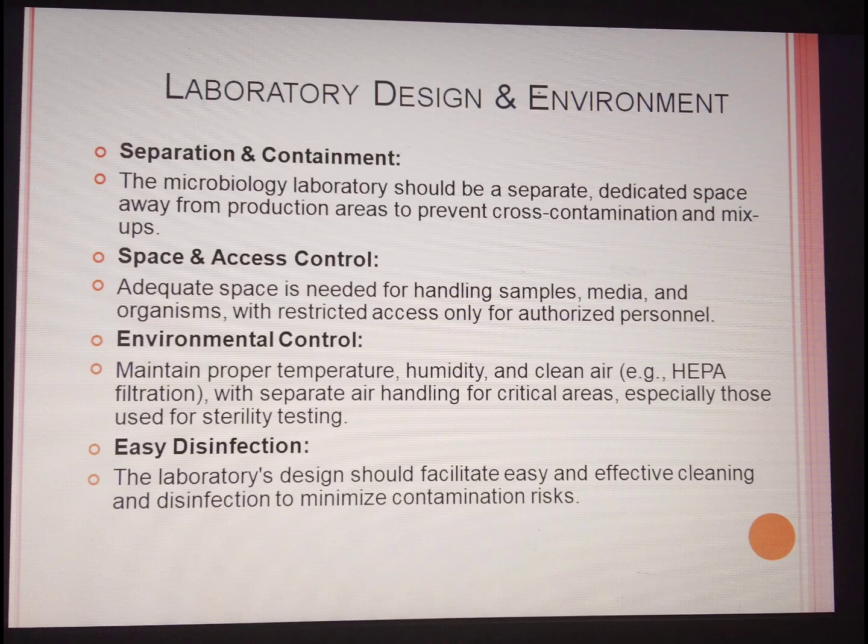personnel. Environmental control. Maintain proper temperature, humidity and clean air, for example HEPA, high efficiency particulate air filter, with separate air handling for critical areas, especially those used for sterility testing. Easy disinfection. The laboratory design should facilitate easy and effective cleaning and disinfection to minimize contamination risk.